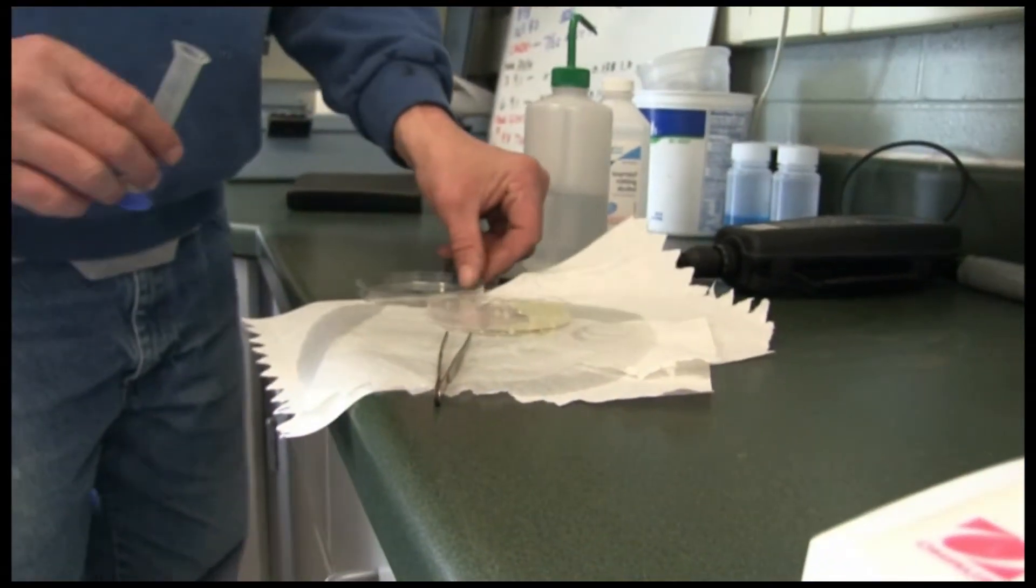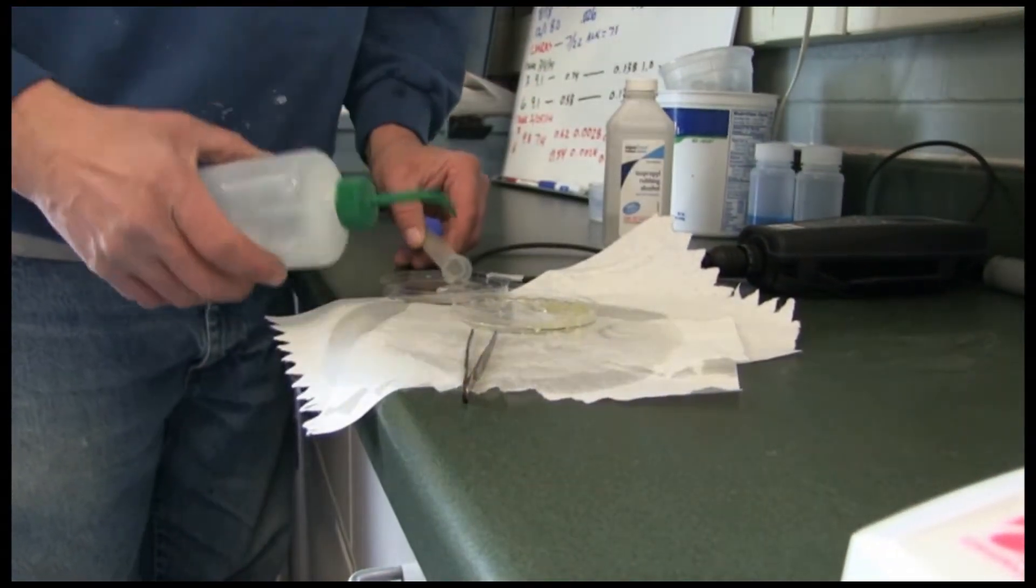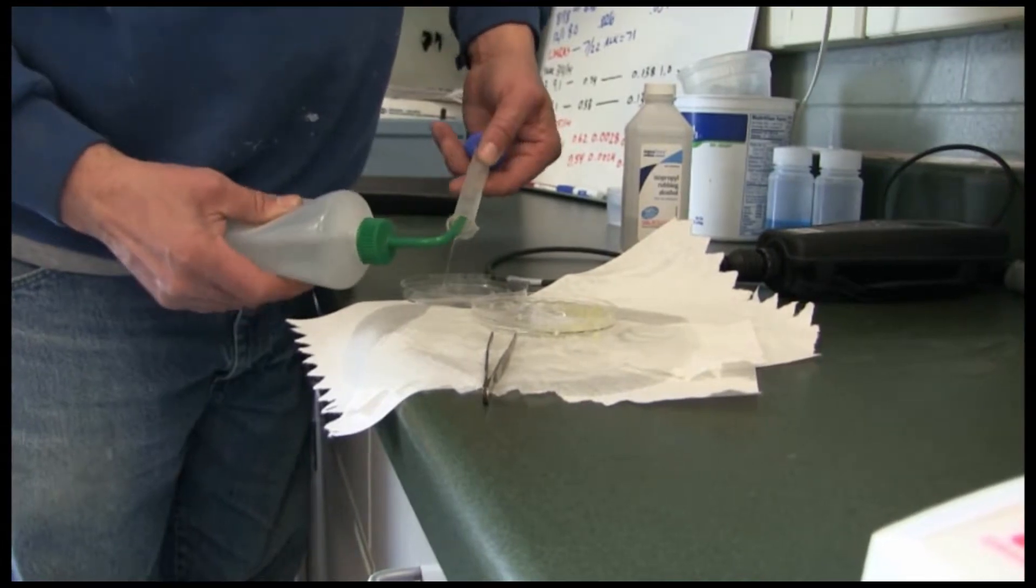Next, pour the eggs and water from the cylinder into an empty petri dish. You may need to rinse out the cylinder to get all the eggs out.